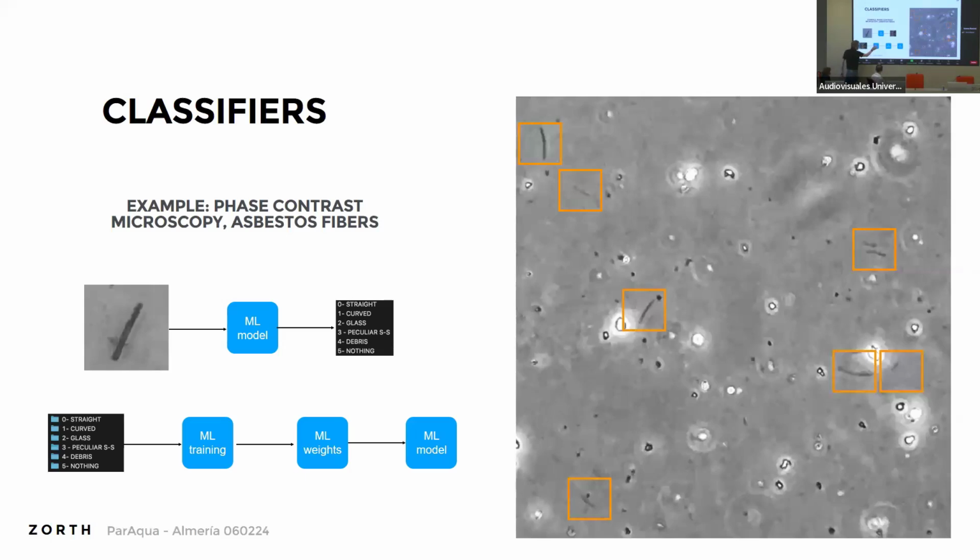You're going to train the machine learning model. Out of this, you basically split the data set into train, validation, and test. Train is what you're going to train the network on. Validation is what is going to feed through your loss function.